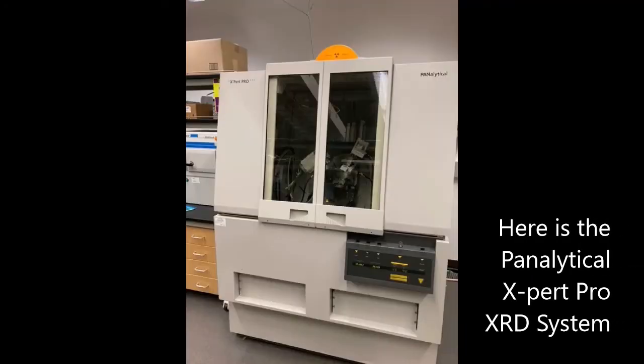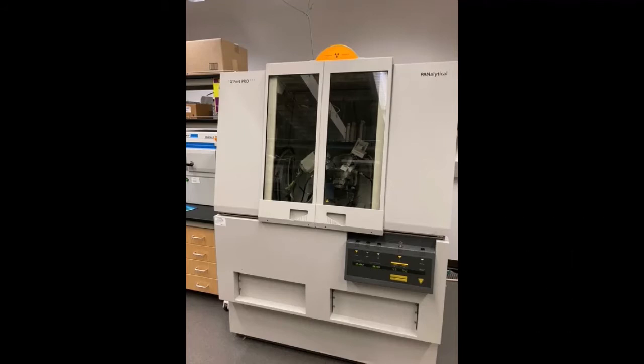Here again we're showing the photograph of the PANalytical X'Pert X-ray diffractometer that we're using in this experiment. The photograph shows the entire unit with the doors closed, and the different diffractometer equipment is located inside behind those windows. We will show you the inner workings of the chamber next, but the first thing we want to do is to show you that in fact it is possible to visualize where the X-ray beam is going to hit the sample.